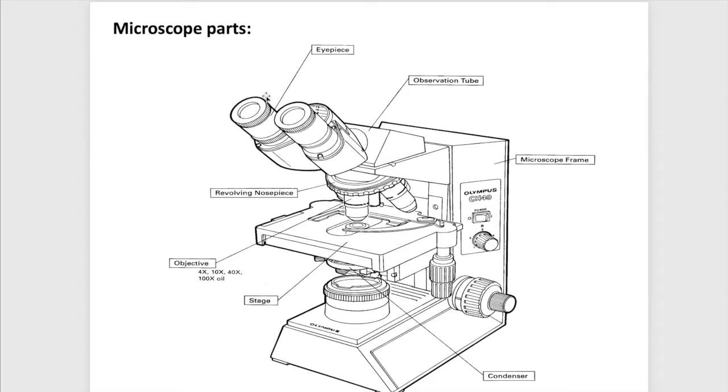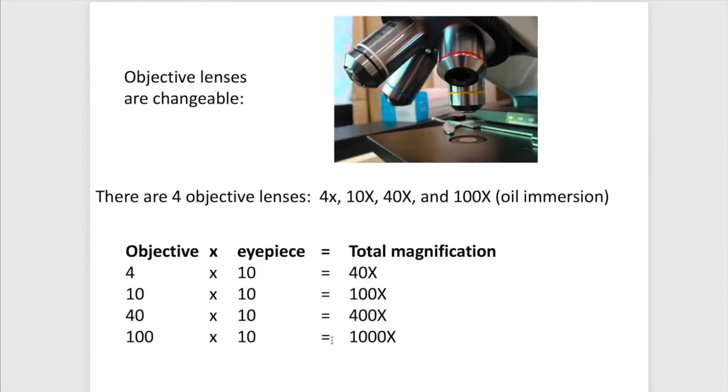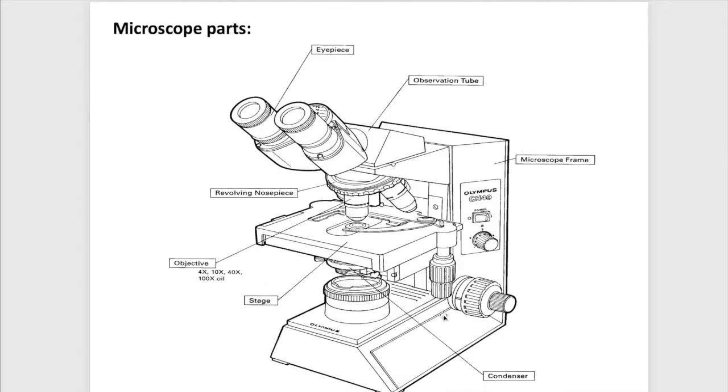So here's a diagram. Here's the eyepiece. Here's the objective. And your basic microscope. And this is a light microscope, meaning that, okay, I have a light bulb here. I can shine the light through here, and I can see. And these are really useful. I get a lot of magnification. I can see how cells work. I can tell when cells are healthy. I can tell when they're unhealthy. And as we saw in the previous slide, I can go up to about 1,000 times the actual size there. So these are very powerful, useful tools in our field of study here.